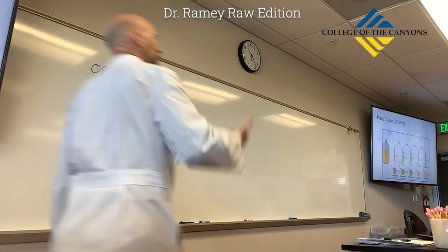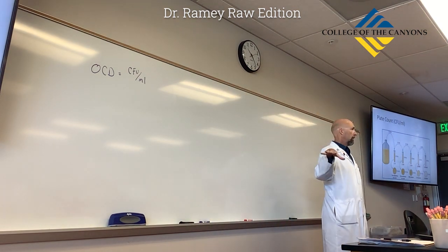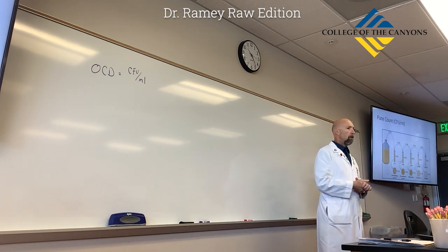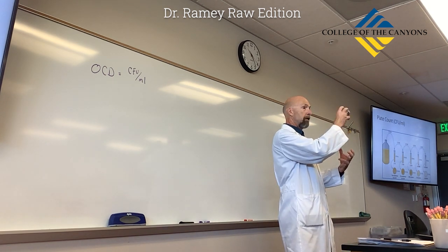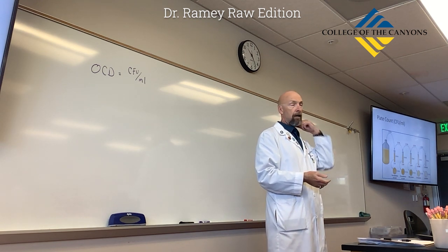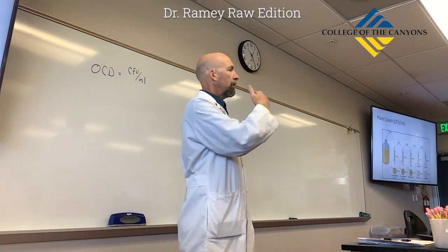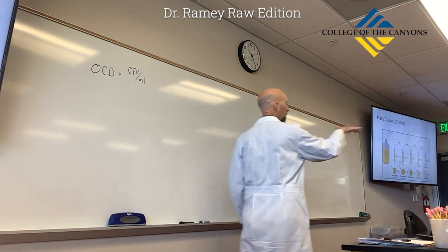So what we have to first do before we inoculate those plates is dilute the amount of bacteria way down from the original culture. So then we take a very diluted culture and take some volume from that, and then inoculate the plate with it and incubate it. So what you can see depicted in this picture here is a two-step process really, right? First you have to do the serial dilution.